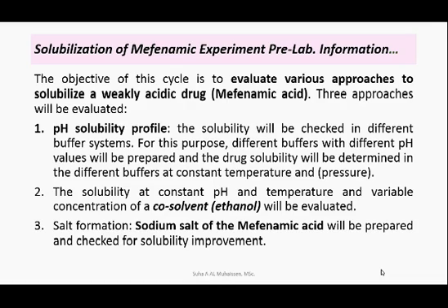The second approach is the effect of co-solvent. And here, the solubility at constant pH and temperature and variable concentration of co-solvent, ethanol as an example, will be evaluated. And the third approach will be salt formation. For this purpose, sodium salt of mefenamic acid will be prepared and checked for solubility, aqueous solubility improvement.